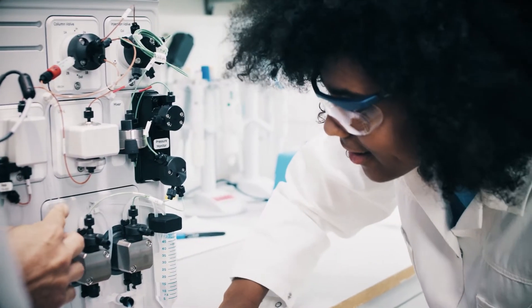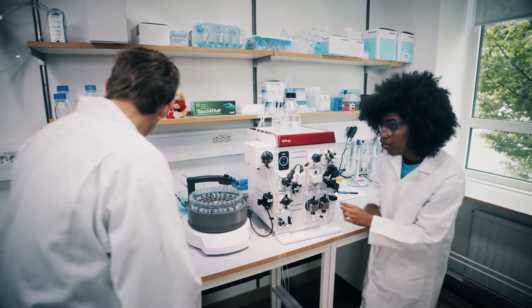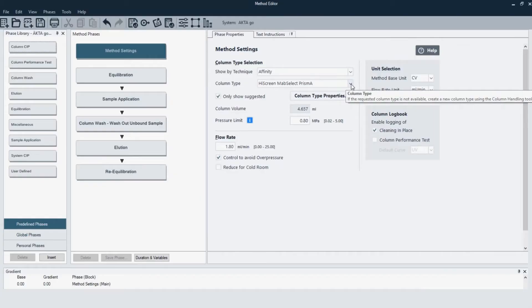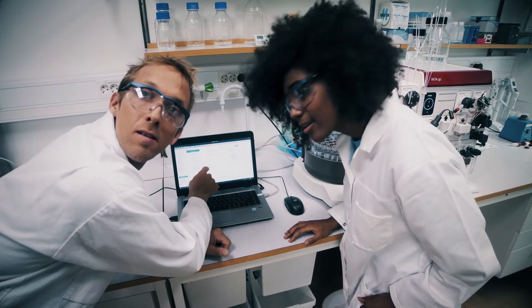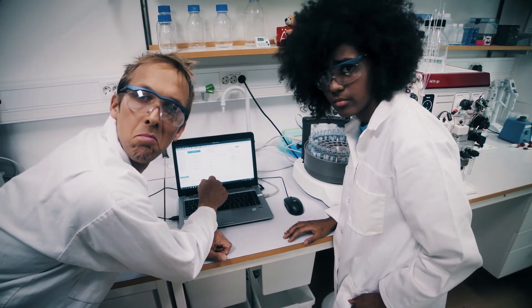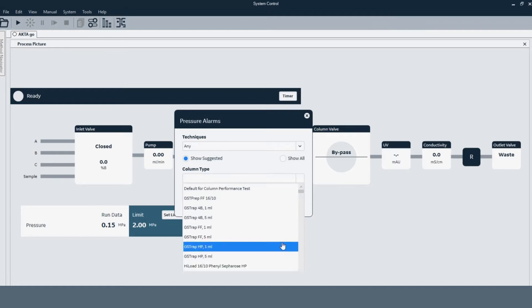Are you guys familiar with UNICORN software? You already know that it provides real-time control and that you can use pre-programmed methods. You also know that you can set it up in just a few minutes and then go. This view gives you a great overview of what's going on and you can interact with the system during runs.